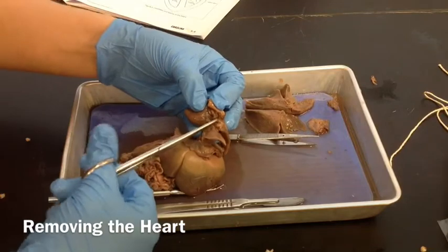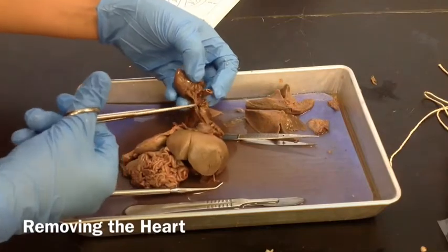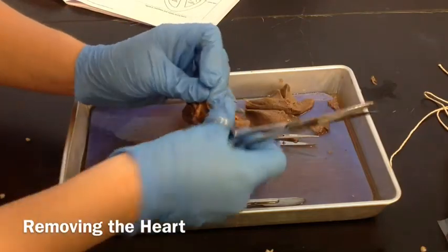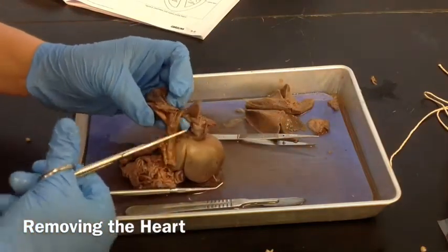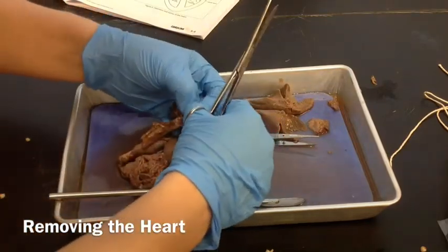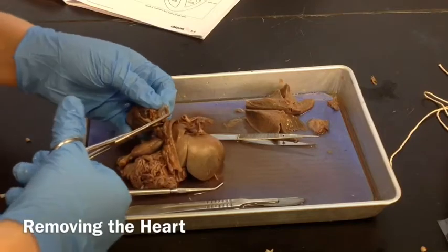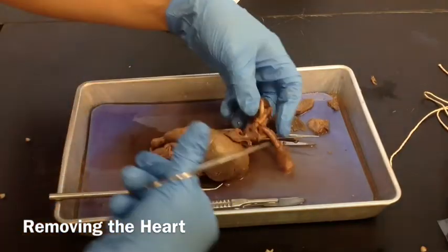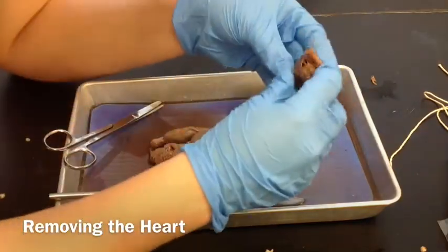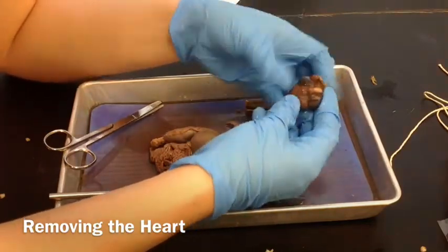I'm going to cut that one there — that's the artery and vein coming from the lungs. On this side we have some of the same things, and lots of connective tissue keeps it all together. More of that pericardial sac. Okay, so that's the heart — this is what it looks like from the front.